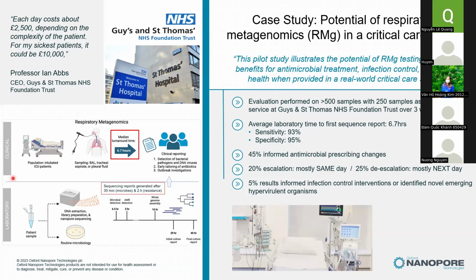I think it's optional, but you can definitely do it, because you will visualize how effective your size selection is. You can see whether there are any smaller fragments, or whether the profile is what you are expecting. It's optional, but it's good to have.